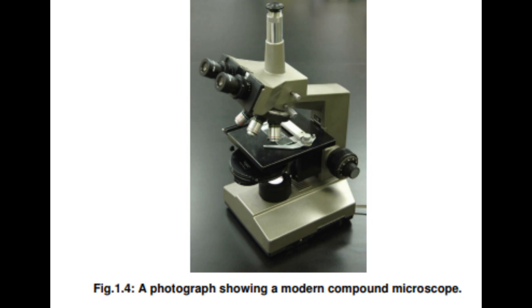Objective. The objective lens gathers light from the specimen, magnifies the image of the specimen, and projects this magnified image. Objective lenses show magnifications in the range of 2 to 100x. Objective is designed to minimize aberrations. Objective can be of two types, dry or immersion. An objective which works with the air between the specimen and the objective lens is called dry. In contrast, an objective that requires liquid, usually transparent, which occupies the space between the object and the front element, is called an immersion objective.